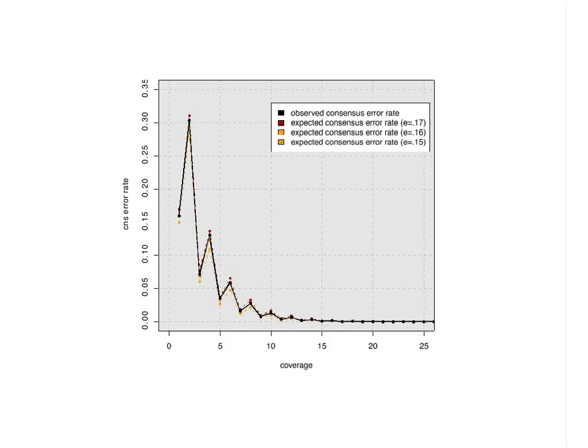Sure. A bacterial genome takes about an hour, so no more than a typical assembler. I think that's what All Paths was reporting for its PacBio bacterial assemblies. So bacterial assemblies can be done on a single compute server. If you're trying to do a gigabase genome like the commenter was attempting, like the parrot genome that we did, that required us to run on hundreds of cores for about a week.